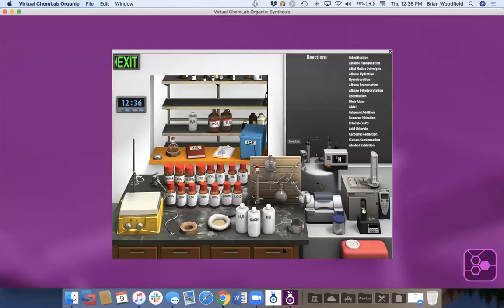So this is a lot busier lab. Each of these simulations, each of these lab benches have their own personality based on the kind of experiments they do. They all kind of have the same features: lab books, clipboards, disposal buckets, chalkboards sometimes, you know.